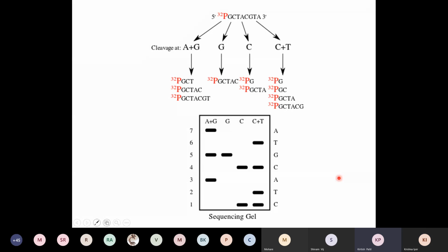Sir, also, is there any machine or technical instrument that counts this base pair? So it has to be done manually. Okay, in this case, you do it manually. When you do autoradiography, you almost have to do it manually. The instrument can probably give you a nice picture of good quality, but for other techniques, which I'm going to show you a little later, the Sanger method, there's a machine which will do all these things for you, and I'll show you how it does it.